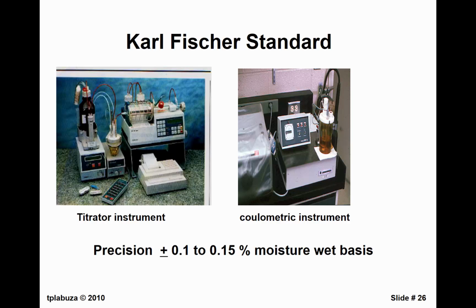One of the real problems now is they've got very special fluids that you use, so you don't have to worry about it. In the days when you used the open titration for the iodine measurement, you had toluene, or what is the other?